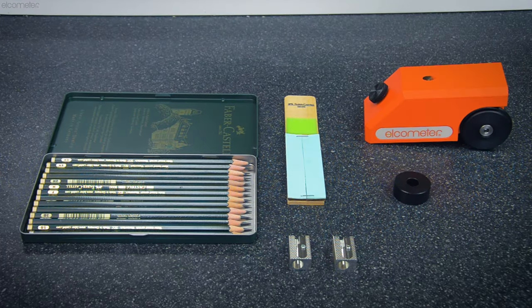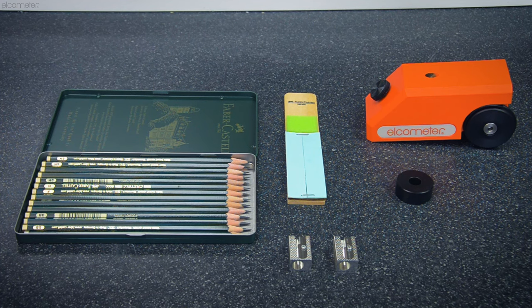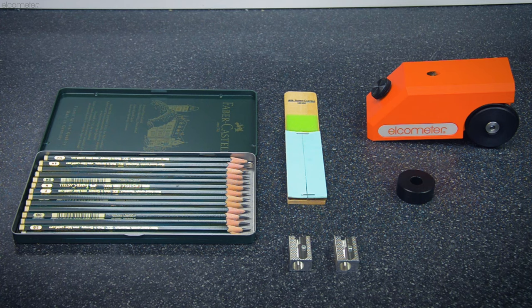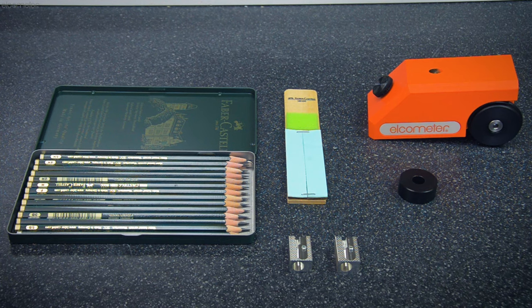Alternatively, some standards state you should use a specially designed tester such as the Elcometer 501, which also includes a set of 14 pencils (again 6H to 6B), the two specialised sharpeners and abrasive paper block, and a setting block of a predefined size for preparing the tester.